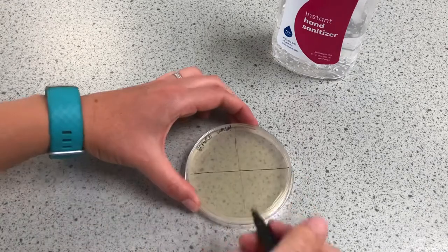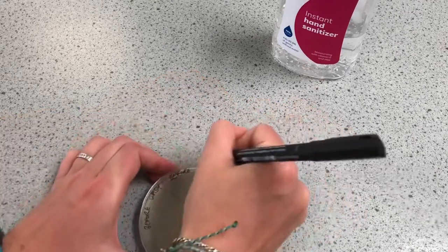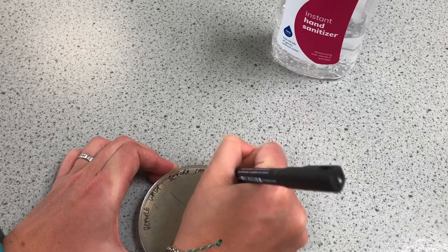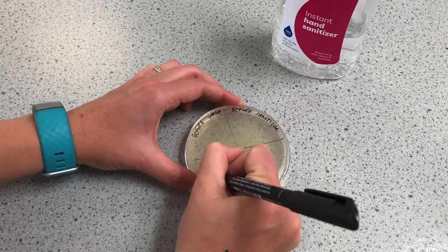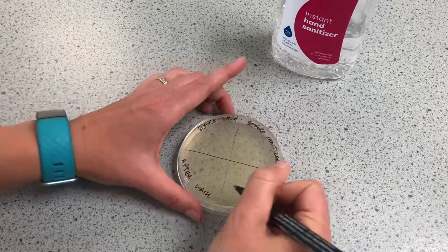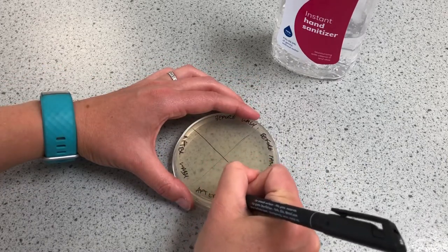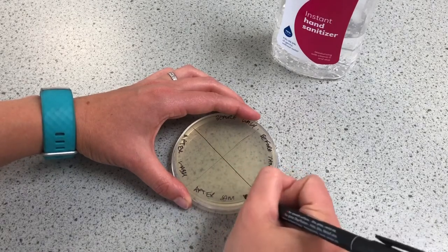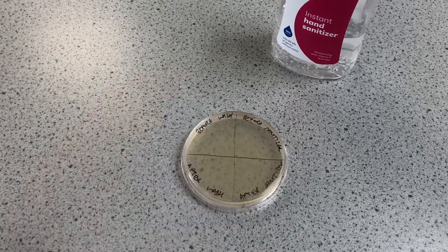So that's 'before' and it's 'hand washing', this is 'before' and it's 'sanitizer', and then we're going to have 'after washing' and 'after sanitizer'. I'm going to come back in a week or two and see how these fare.